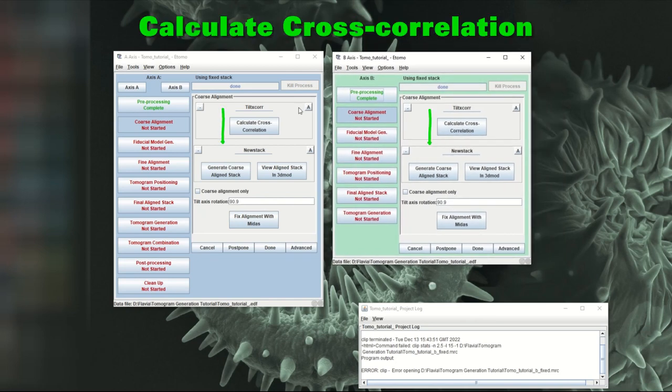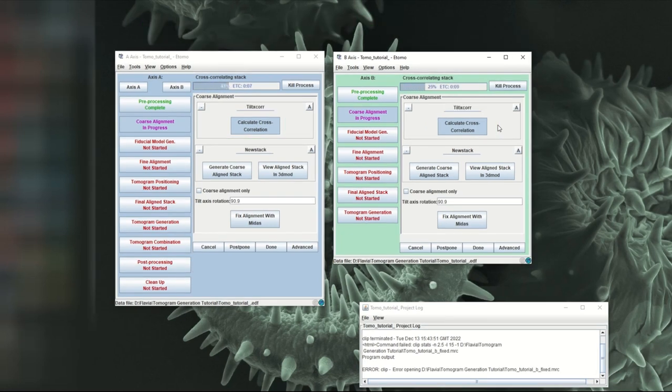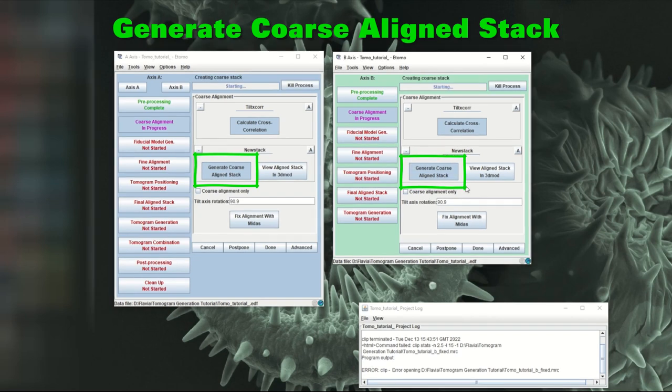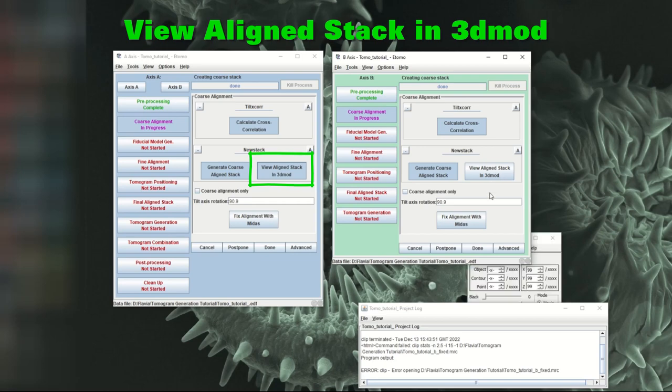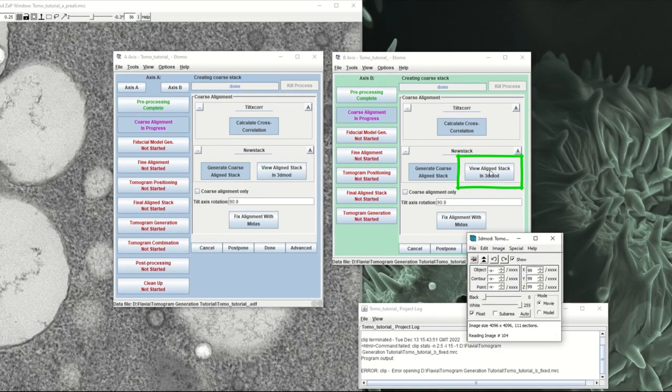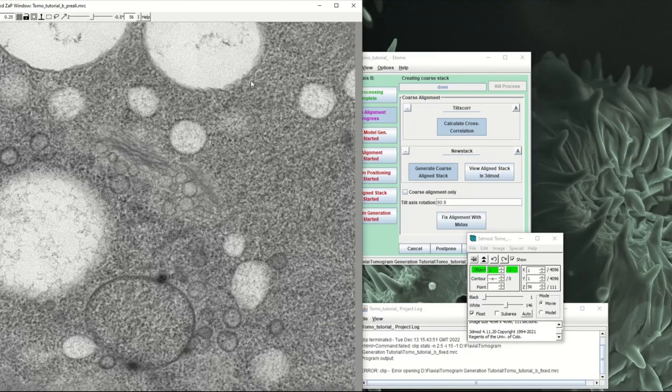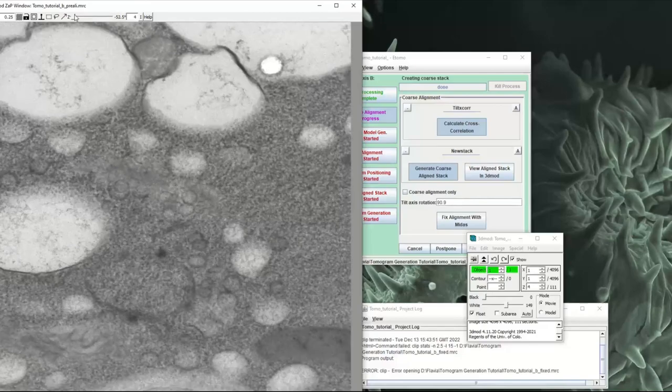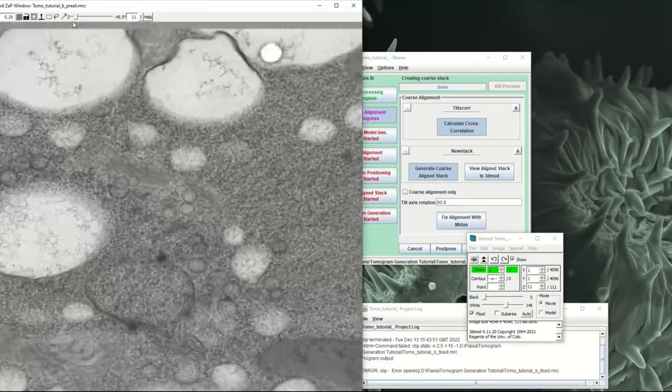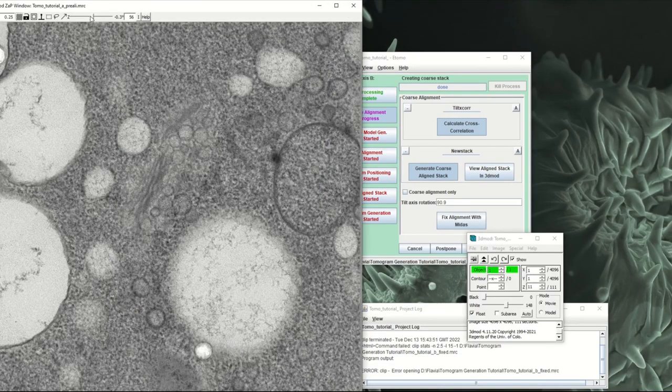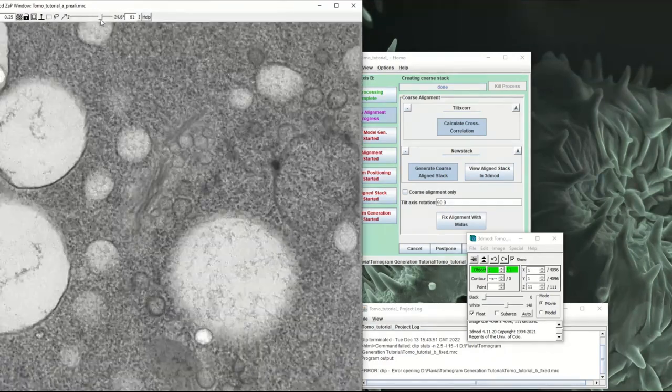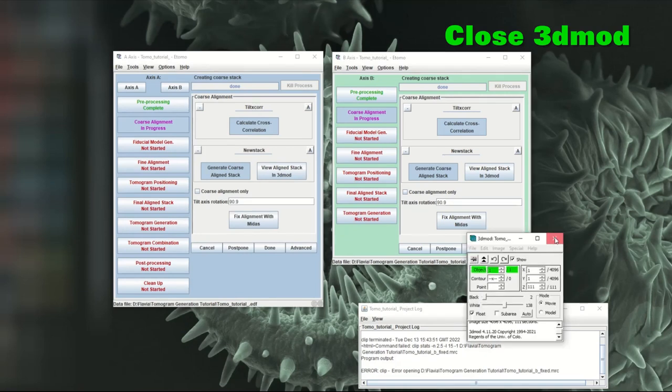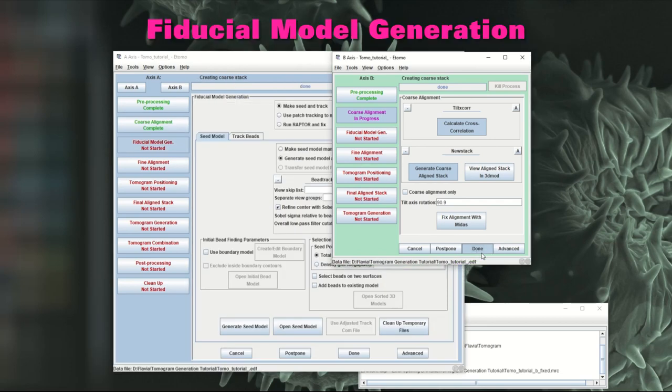Now move on to calculate the cross correlation and generate course aligned stack. Let's have a look at the align stacks to see if they're OK. So when you click these buttons view, it just opens 3D mod and then you can see on 3D mod where the align stacks look OK. This one looks fine and then this one here also looks fine. Then you can close 3D mod and just click done for this step.